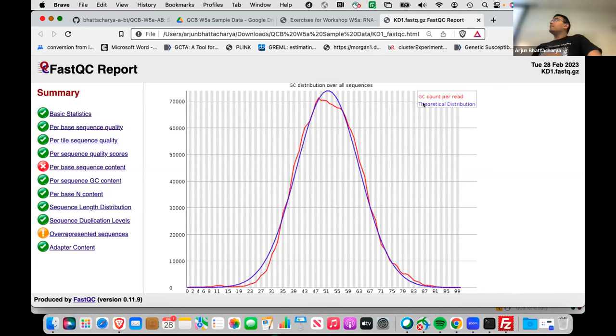One of the good innovations of these pseudo-alignment methods, Salmon in particular, is that, at least for humans, they can correct for GC bias. So sometimes you'll see a little bit of a squiggle here, or a fatter tail. Salmon can go back and correct that based on what it learned from other parts of the transcriptome. But again, I've never really worked with bacterial RNA-seq, so you're going to have to read other papers and see how they deal with it.